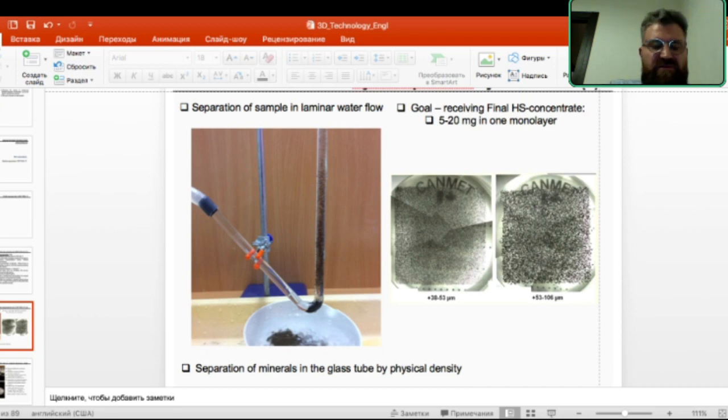Because we have the water tank on the top that holds the whole process water, so we can pour that EPD water into the tank instead of the clean water. So it will all be the same range of particles. So it's another advantage of hydroseparation. But in all our projects, we just use the tap water.